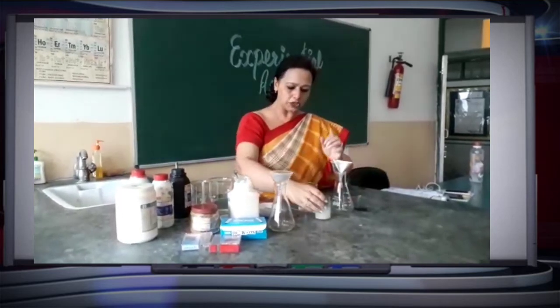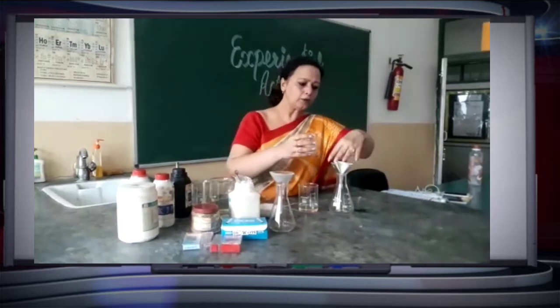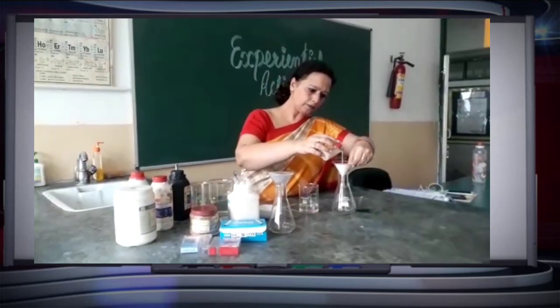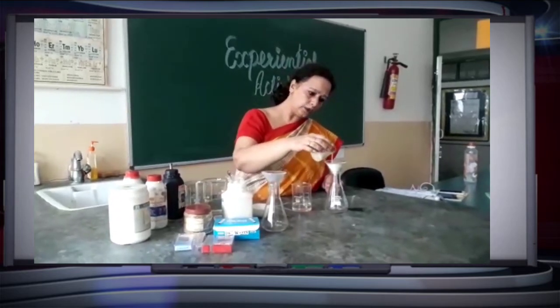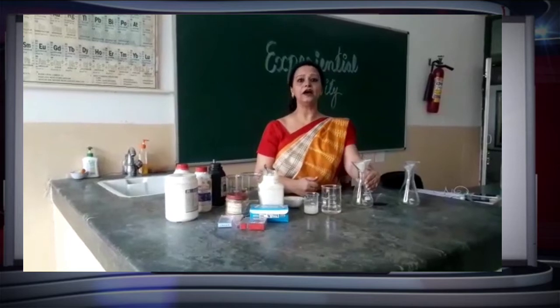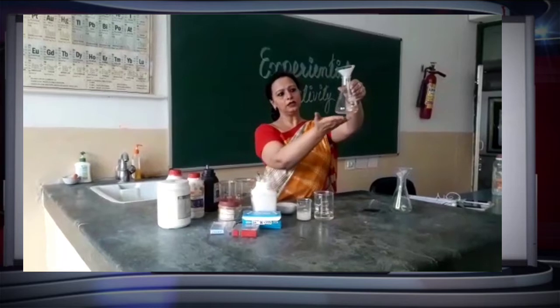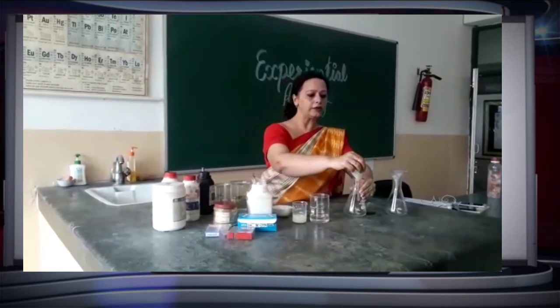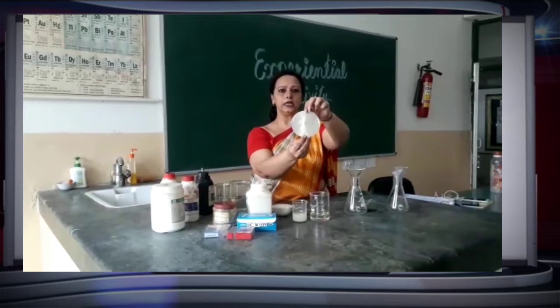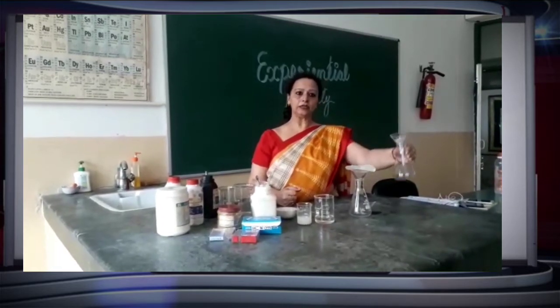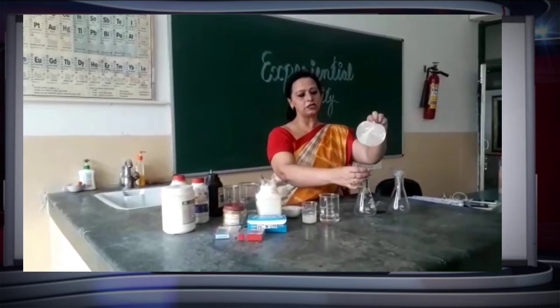Now let us filter the suspension and see what happens. It will take time because the calcium carbonate is not fully dissolved. Now let us see what has happened in the case of suspension. You can see the filtrate is clear, but when we check the filter paper, there is residue on it. So in filtration, we cannot separate the components of a true solution using filter paper, but in the case of suspension, we are able to do so.